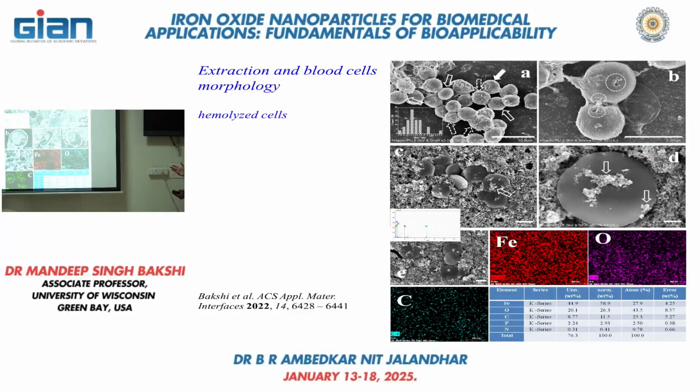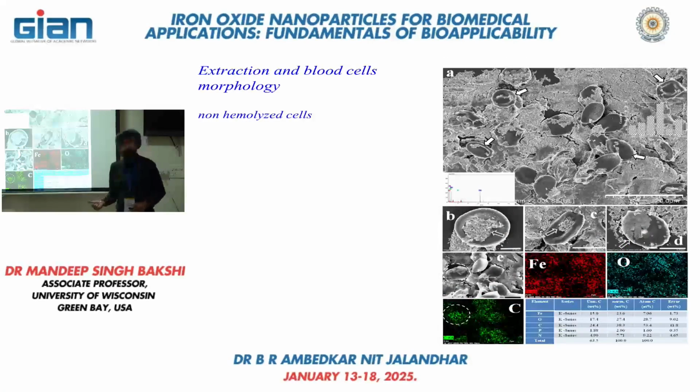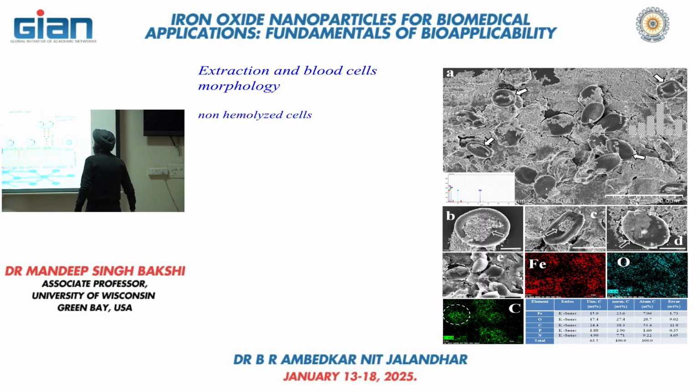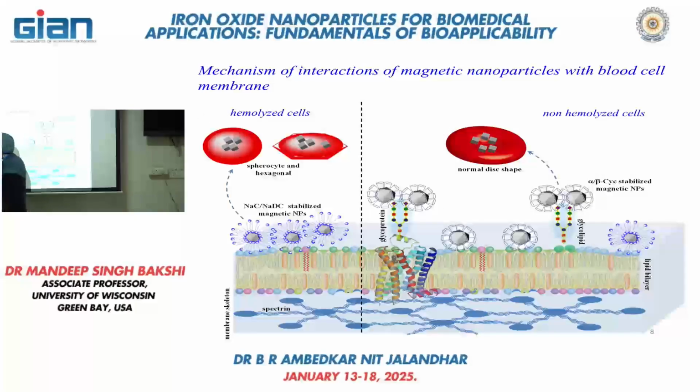Then, what is the conclusion for these experiments? How can we use this technique to replace the centrifugation method? What we should do? We should come to the mechanism. Here is the mechanism. So I have divided this into a complicated image. I'm going to explain it.